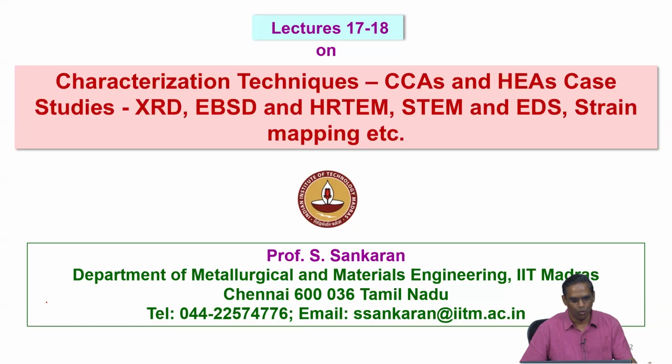All these characterization techniques we know. And the interesting point is most of these compositionally complex alloys or high entropy alloys form simple phases like FCC, BCC and HCP. As long as they form simple phases, these characterization techniques will be useful.